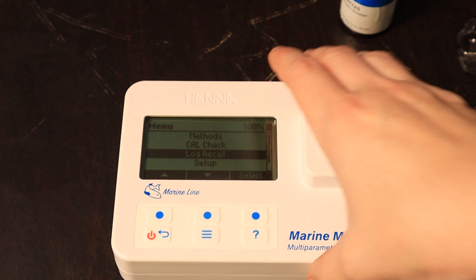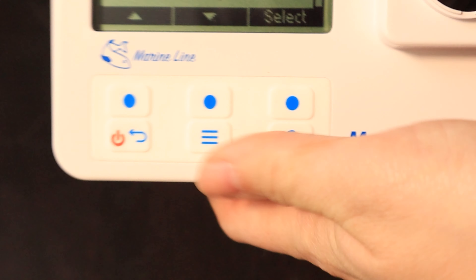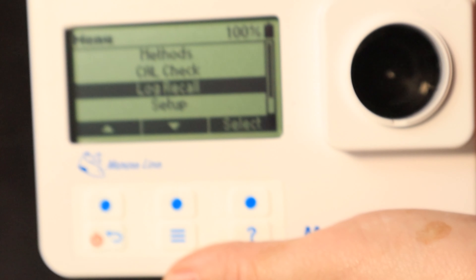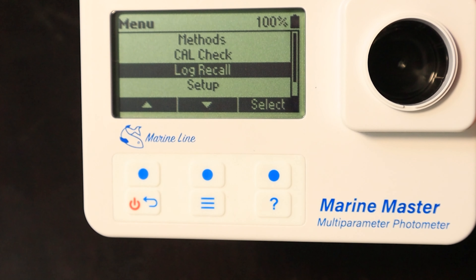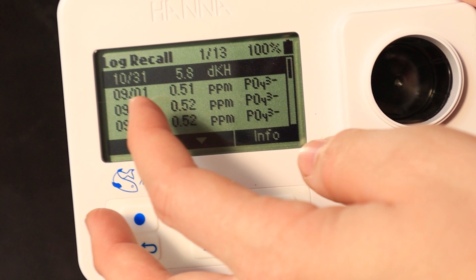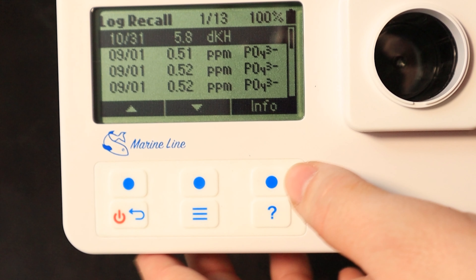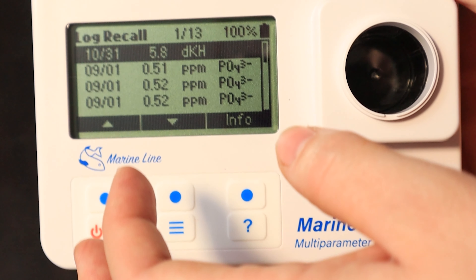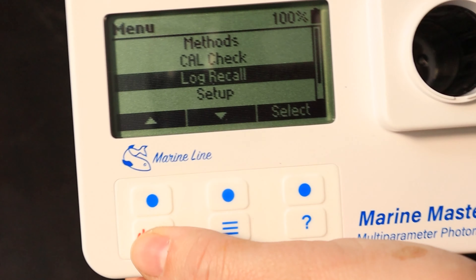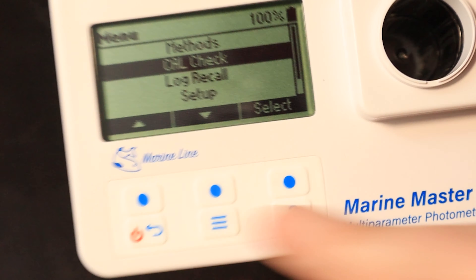Now I thought this was really neat — if you look at this, you can scroll down to log recall. Hit select, and your test result for tank number one is right there from the test you just did. You can also delete any test results on here, but it saves them all. I thought that was really cool. So now we're going to go back and do nitrates next.